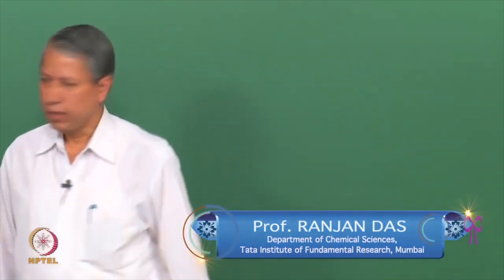Today, we are going to study the application of electron paramagnetic resonance spectroscopy to photochemical research. So that is photochemistry and EPR.